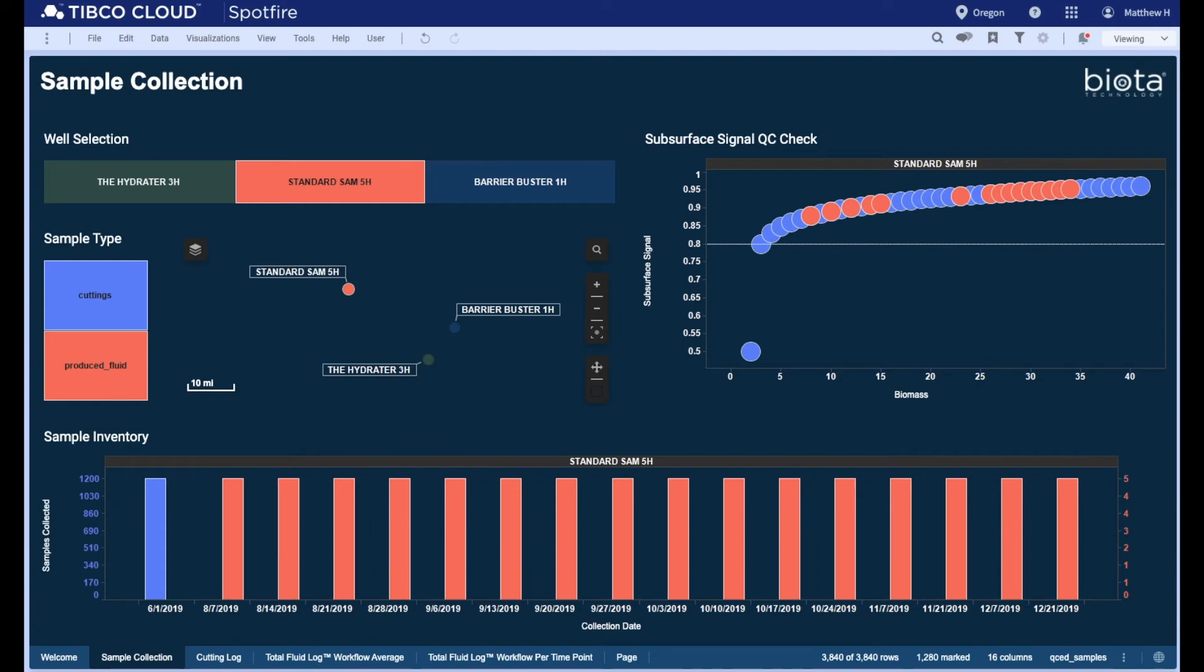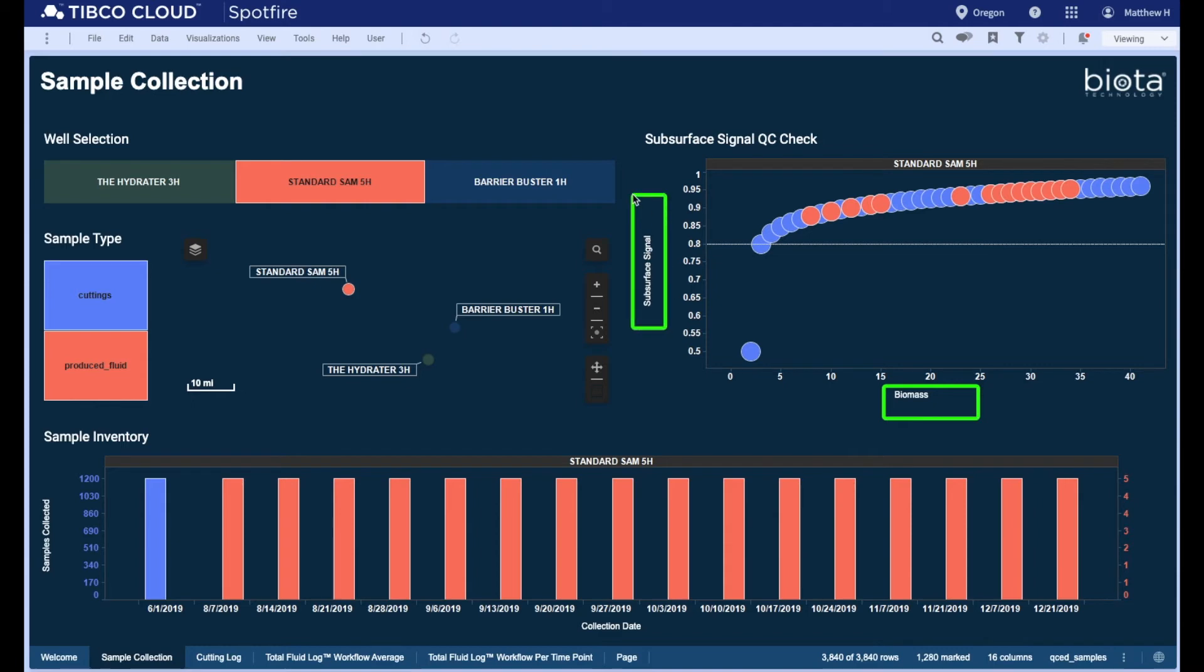The top right scatter plot shows our strict in-house quality control cutoffs. We plot biomass or total DNA recovered on the x-axis and subsurface signal on the y-axis. Think of this graph as a signal-to-noise ratio. DNA is a very sensitive measurement and care must be taken to ensure that technical or background signals are not carried into downstream analysis.